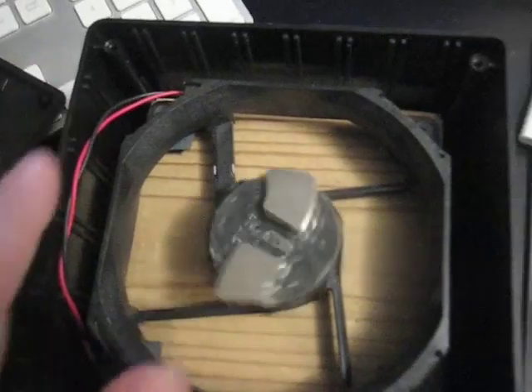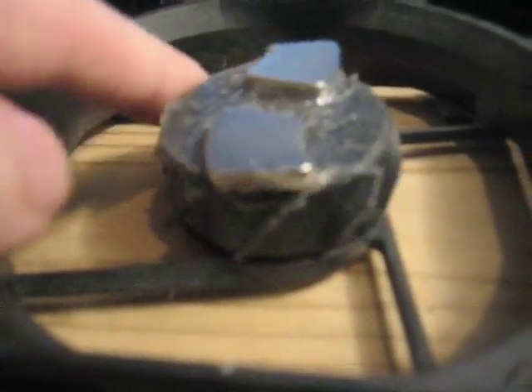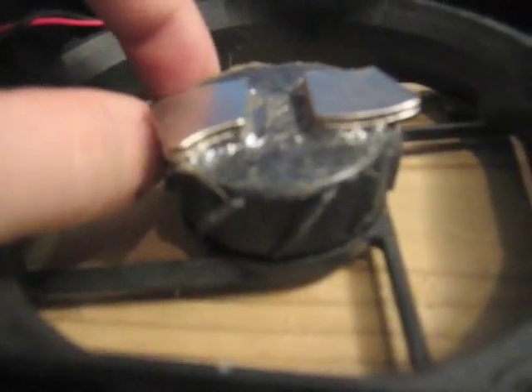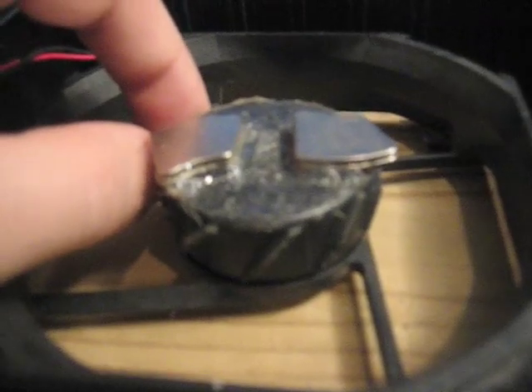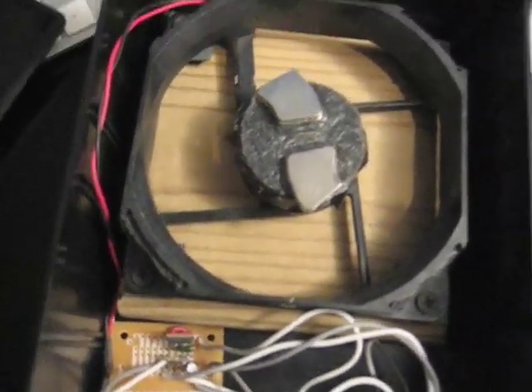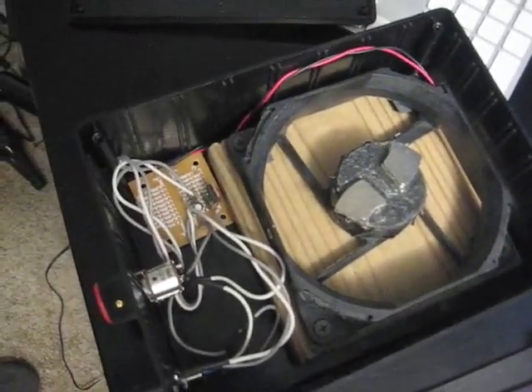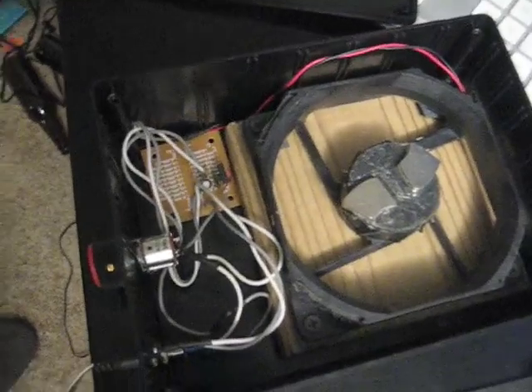I have a 120mm fan that I've cut all the blades off of, and I've taken apart a hard drive and we have four hard drive magnets — two stacked on top of each other and put on opposite ends. So when they spin, they create the magnetic field that rotates the screw on top, which will be an actual magnetic stir bar to go along with the Erlenmeyer flask to actually stir the yeast.